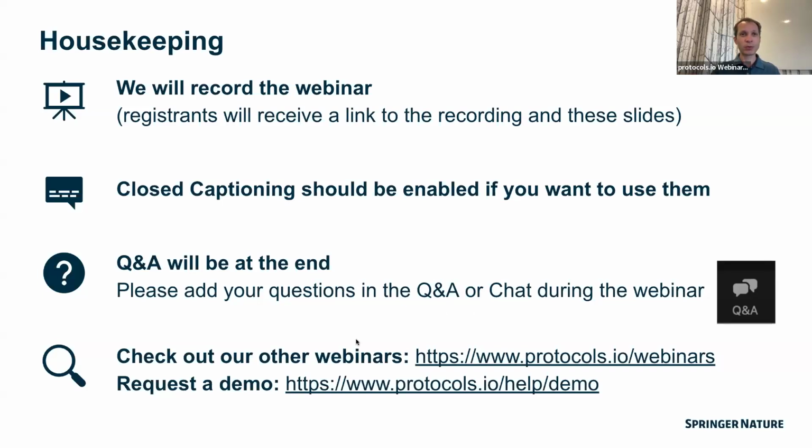Either one will work. As I said, this is the tips and tricks webinar for people who are already familiar with Protocols.io. It's not an introductory one. So we'll go into some less intuitive features of Protocols.io, harder to pick up on your own without looking at a tutorial or help page. Not all of them are complicated, what we'll cover in the webinar, but it's not an intro one.